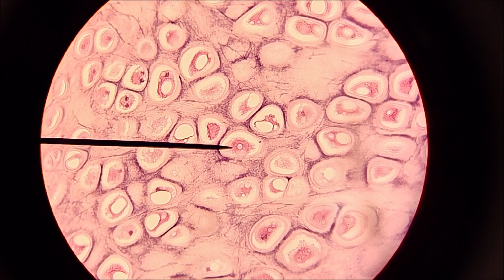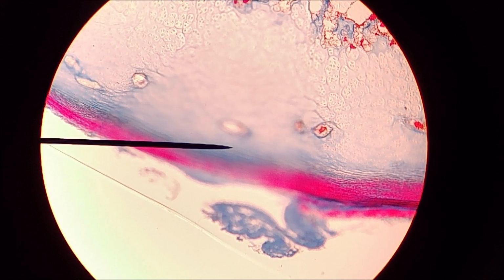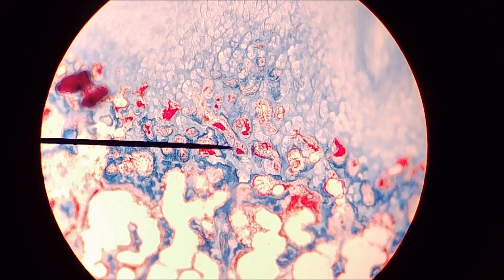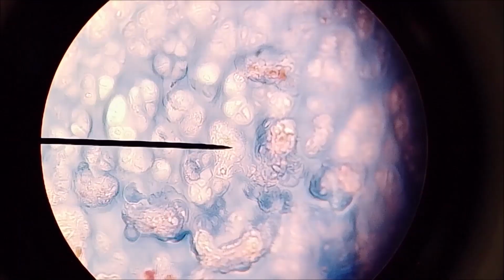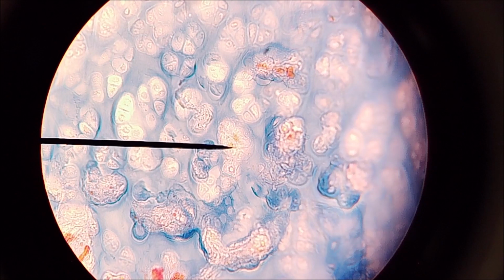Now, that's that. Then this is going to be fibrocartilage. Let's see if we can find it here. Probably help if I drop my mag a little. There we go. Now, the slides for fibrocartilage don't preserve well, which is why we have this appearance here. But if I zoom in on it, you would notice that it is kind of similar in structure to the previous ones we've looked at. We've got this nucleus pulposus, this gooey center portion. It looks a lot like what we just looked at.